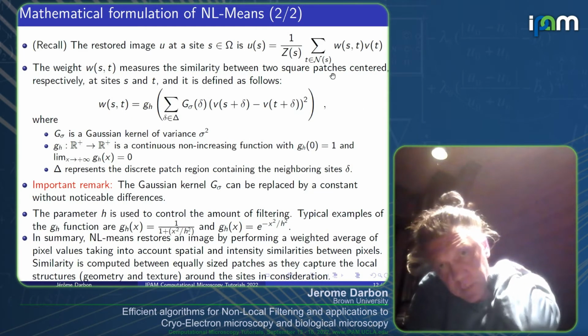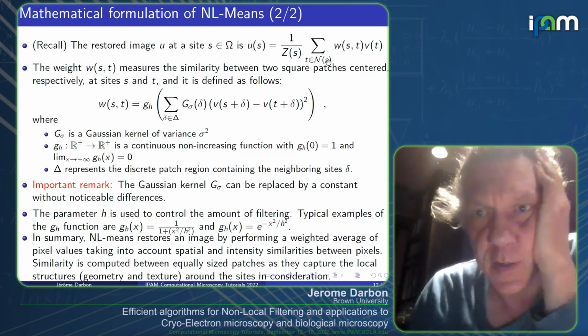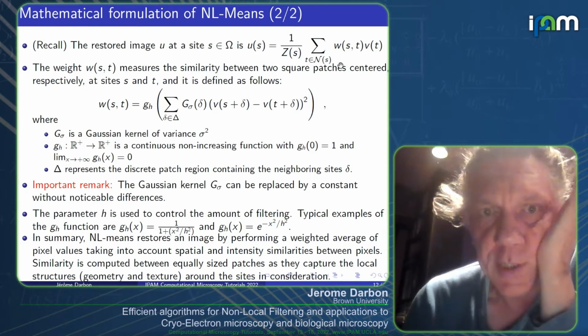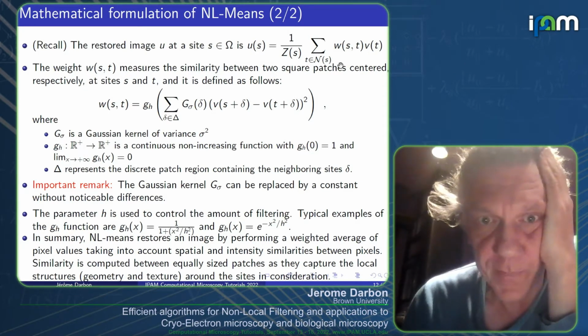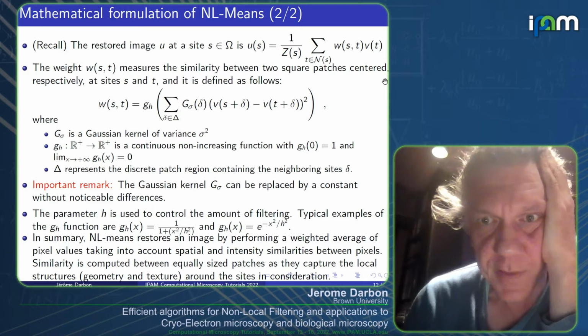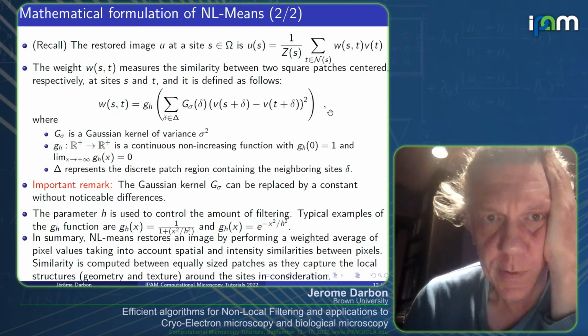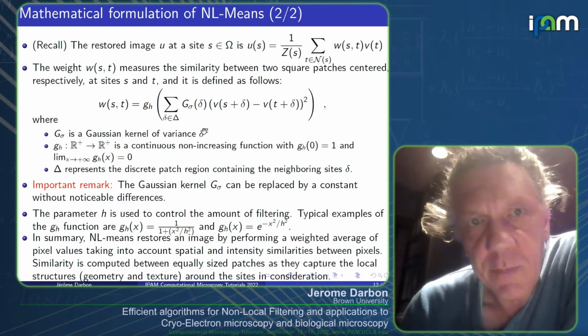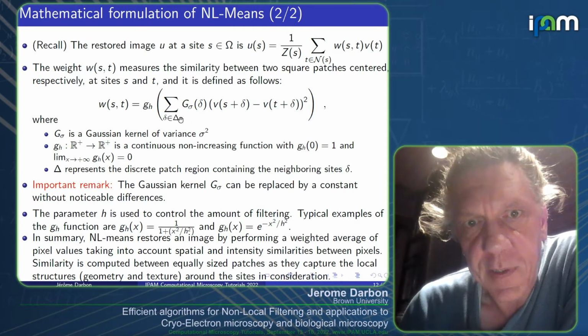Now, this is the formula above to perform the averaging. Now we need to know how to compute the weights. So this is the original formulation of how we're going to compute the weights. What do we see here? What we see is as follows.